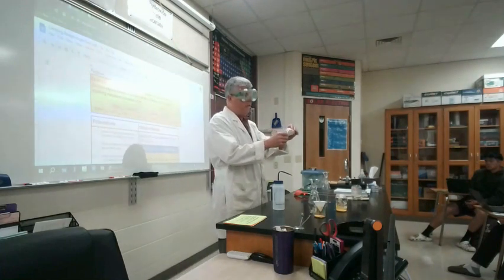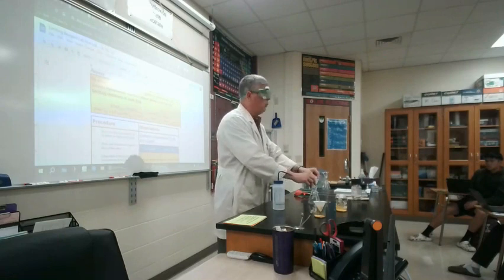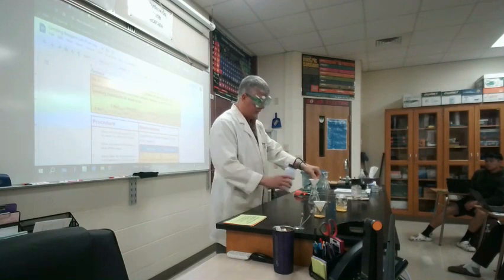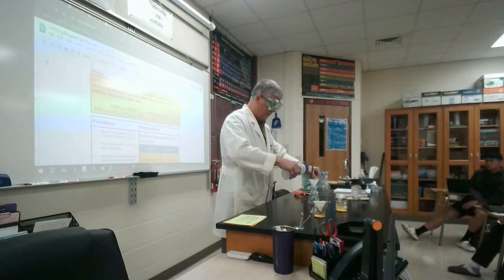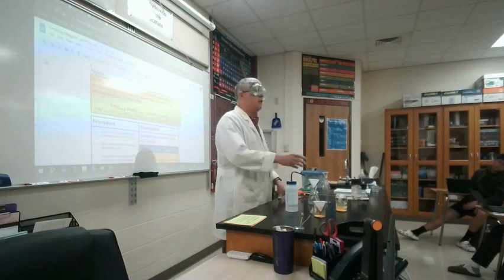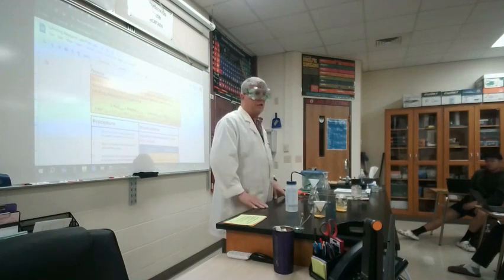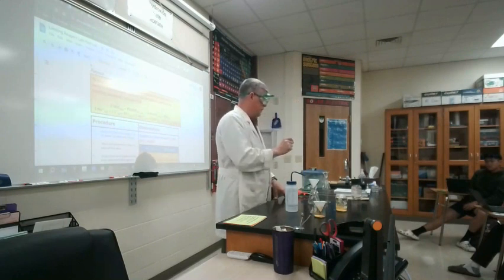You will see 4 folds when you look at it. 3 of them go towards you, 1 of them goes away. Push this so that it is down in as low as it can go, and then wet it down completely. That will get you a good seal. That will also make it stick to the sides of the glass so that as you're pouring, it doesn't get in your way. Pour slowly.